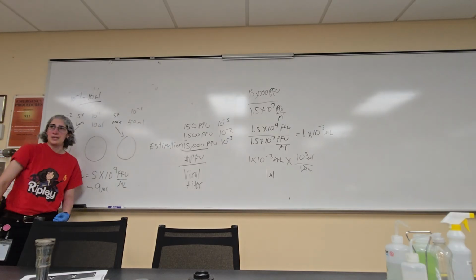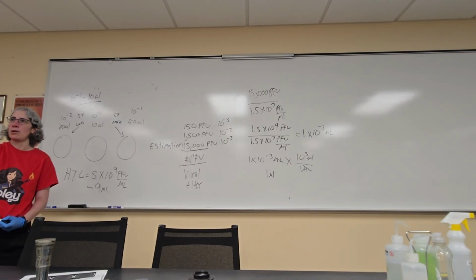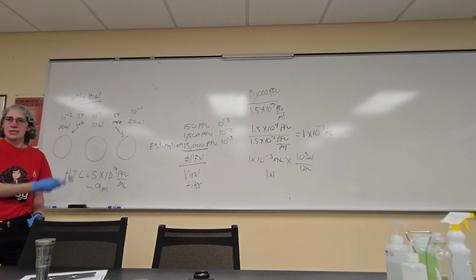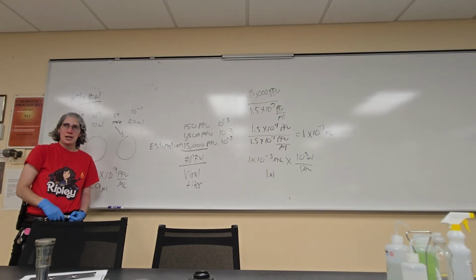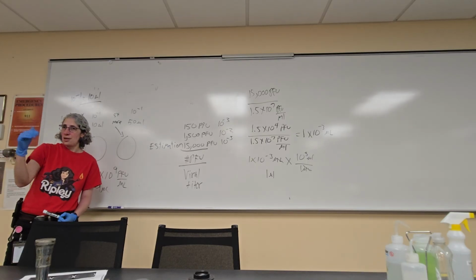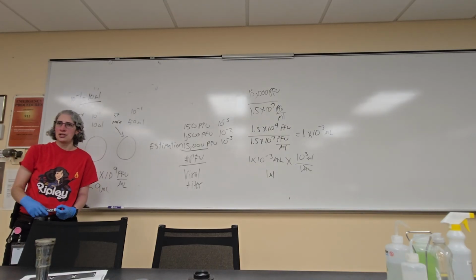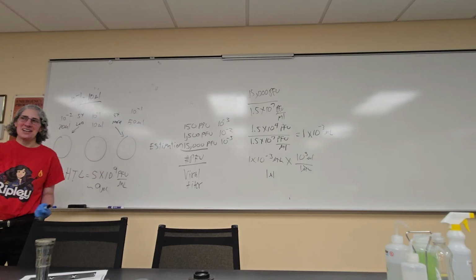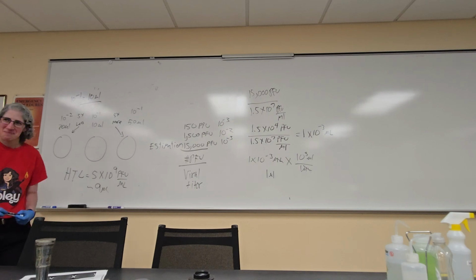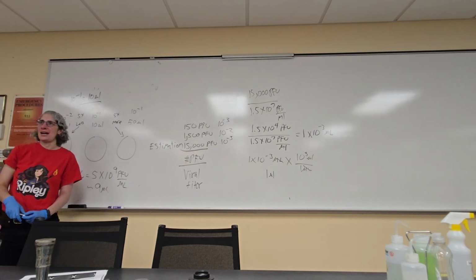Okay? Because we're going to use this to isolate DNA for our restriction digest, and also send 1 sample off for sequencing. And then we're going to send stuff to CU for the electron microscopy imaging. They'll take as low as 10 to the 8th, but they prefer the 10 to the 9th, and since they charge by the hour, it's better to have the higher titer, so it's easier for them to find the virus, and it won't cost us as much. But that's basically the math that you would do.